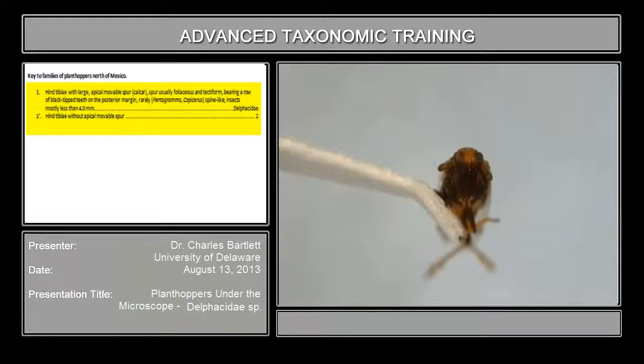So the calcar. What we'll do is maneuver this specimen so we can see the hind tibiae.